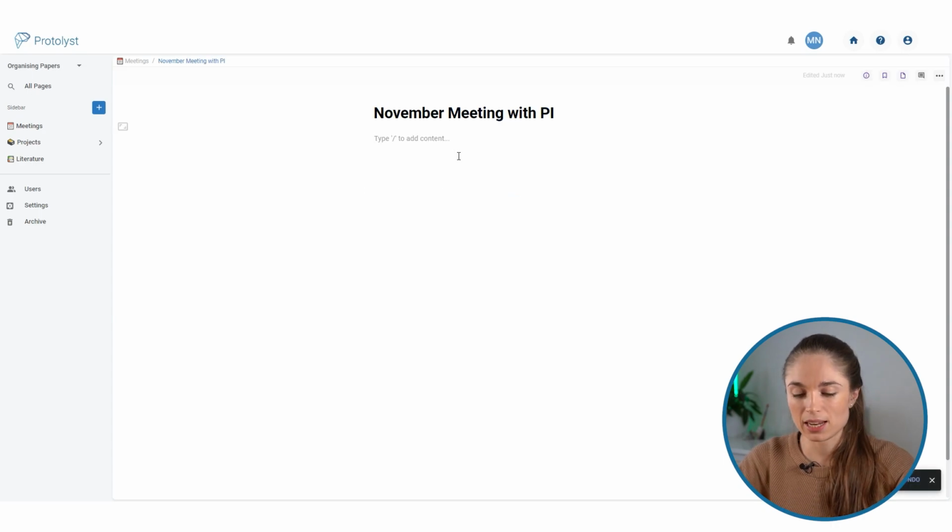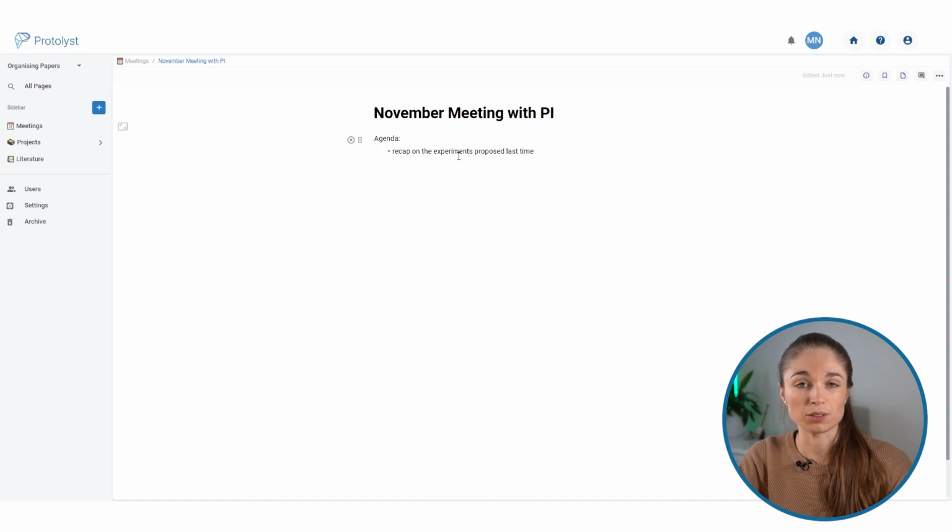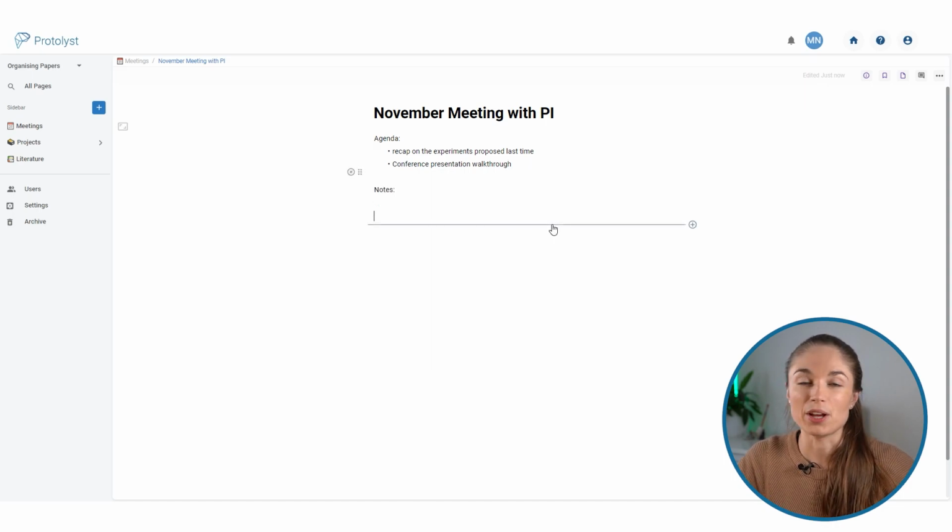As I prepare for the meeting, I can put together an agenda. We can recap on the experiments proposed last time, and I can look at the October notes and refer to those. Last time I also mentioned a conference, so perhaps I've got a conference presentation walkthrough, and that's going to be the whole agenda for the meeting, and then I'm going to have my notes section here.